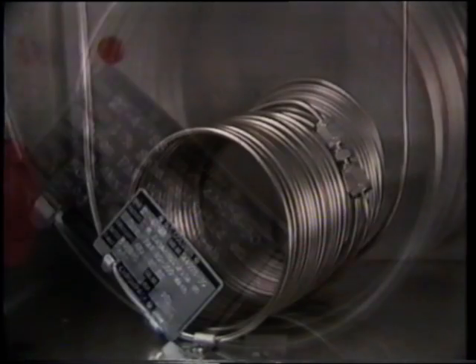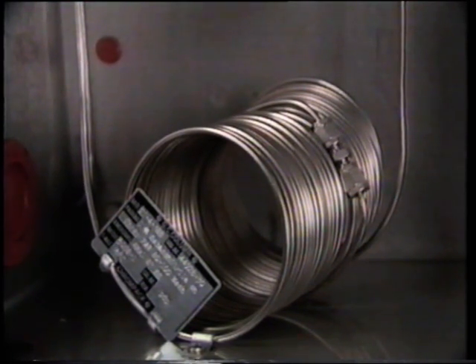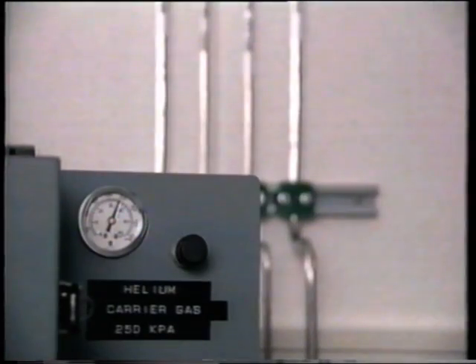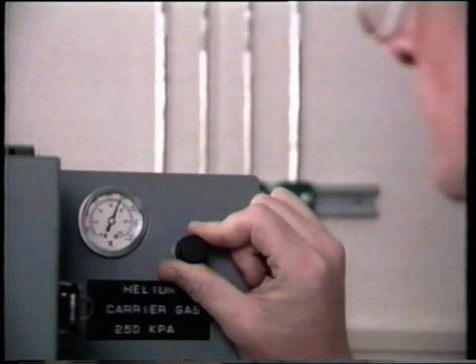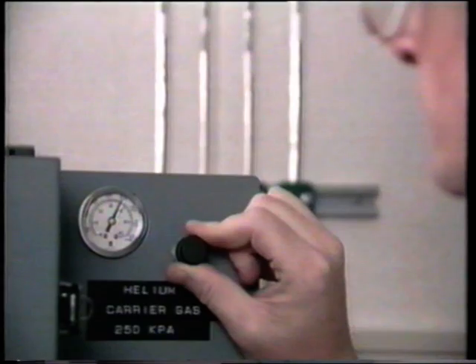However, excessive pressure and flow rates may reduce separation. Lower flow rates may lengthen analysis and elution times. If tests indicate insufficient carrier gas flow, pressure can be adjusted to meet the requirements of your particular application.